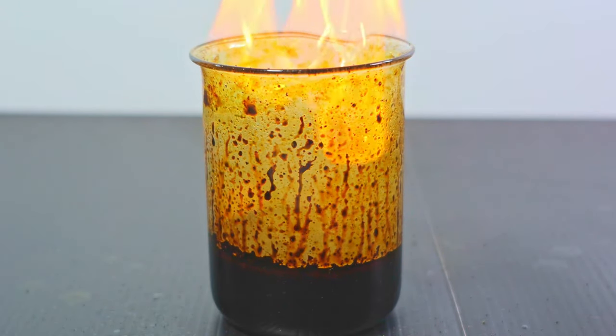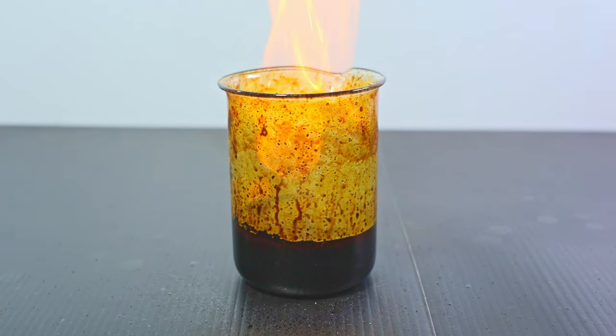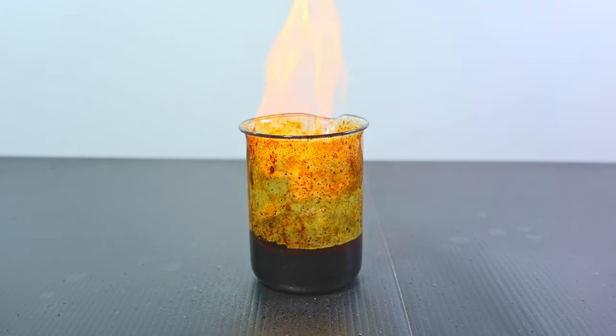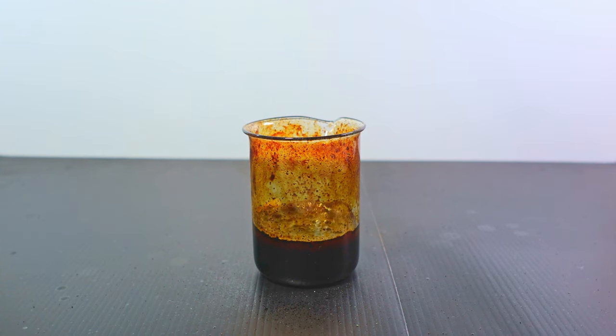Contrary to popular belief, chromic acid isn't really a proper acid but a mixture of sulfuric acid and chromate salts, in this case sodium dichromate. Nevertheless, it is still very oxidizing to organic compounds, as you'll soon see.